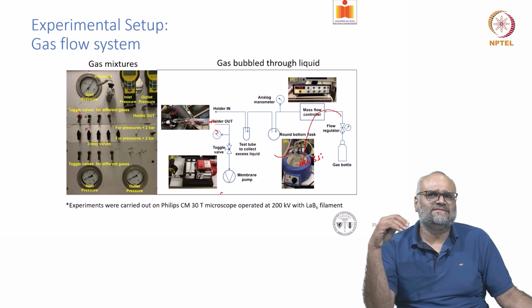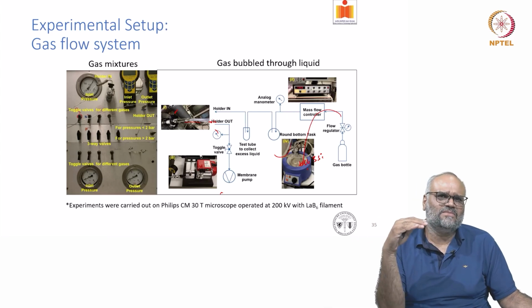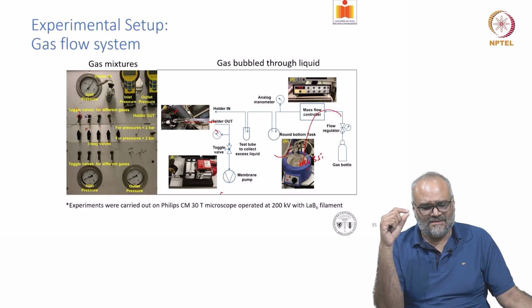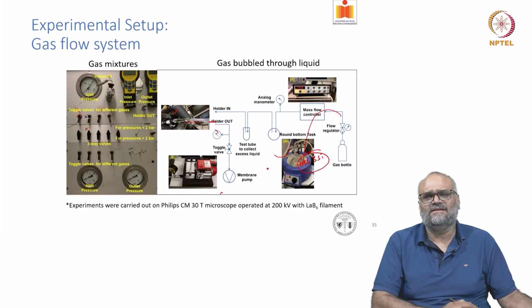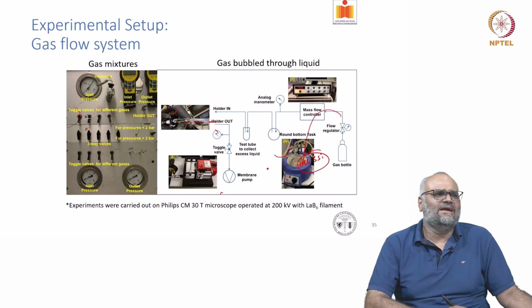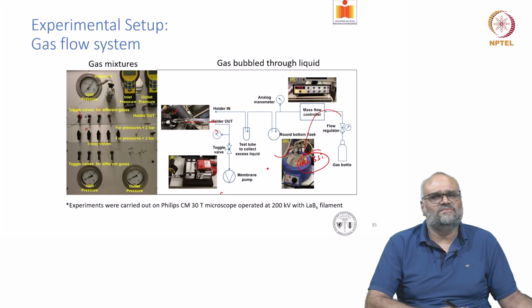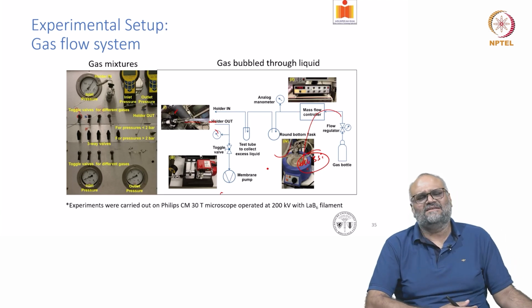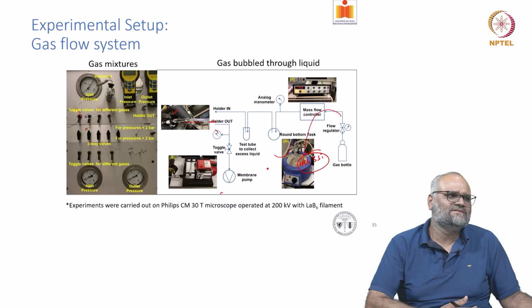So the idea is, when gas flows into the microscope, into the holder and the nanoreactor, you are having saturated oxygen, which is also containing vapors of HCl, or it's kind of an aerosol, and you can use this to study corrosion behavior. So having told that you can assemble the holders and so on, I just want to highlight a few issues that you can run into with these kind of setups.